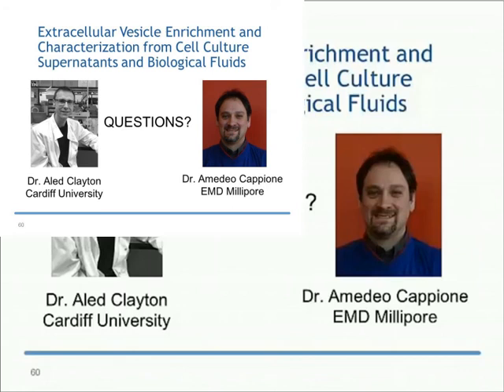These quick and easy tricks do have caveats, however, because lipid content and protein content of a given vesicle may change in different situations. For example, in cancer, there's some evidence to suggest that the protein load per vesicle is much higher, in which case our particle-to-protein ratio measurement will be affected by that and will give an artificially low number. So just use it sensibly, as long as you're aware of the pitfalls of it. As a routine day-to-day lab tool, we find the particle-to-protein measurement is a very, very useful way of tracking the quality of preparations routinely.